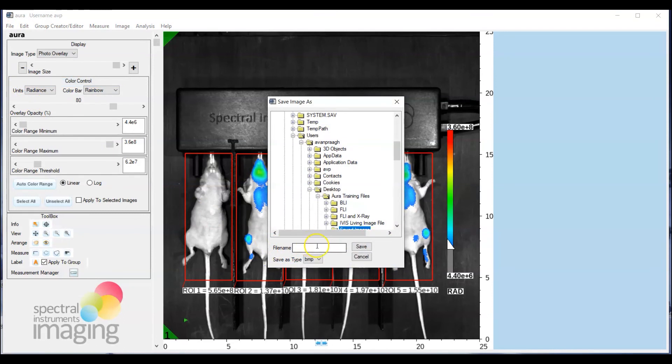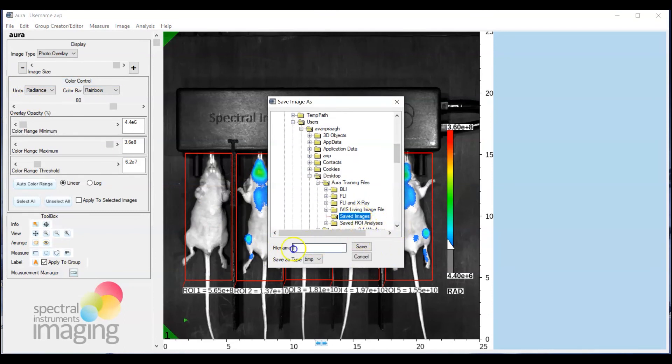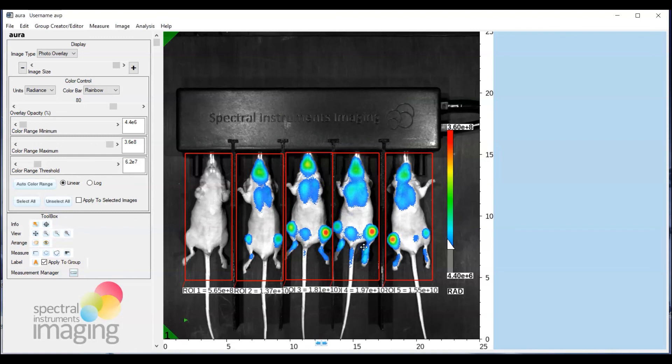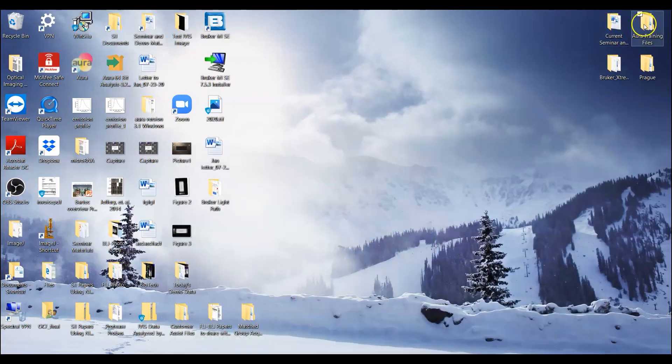And you can then select your storage area of choice, we can do an example here of just call it ROI analysis. You can save it as a JPEG, there are choices, hit save.